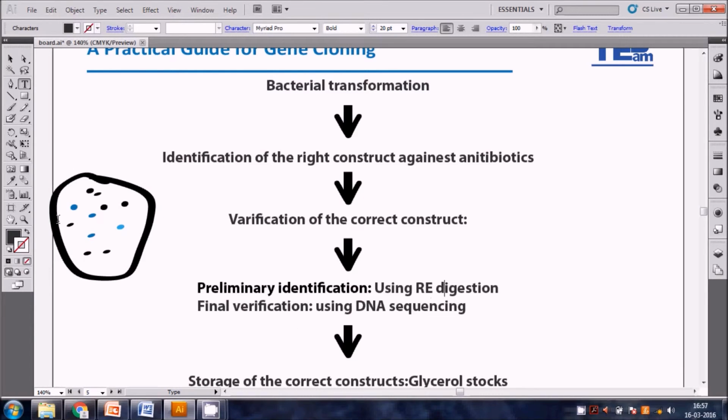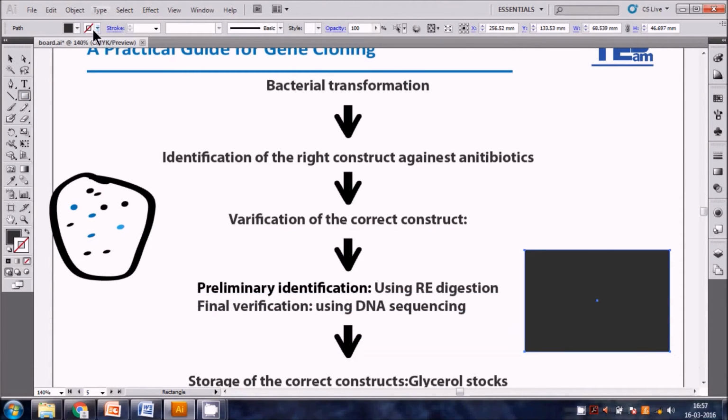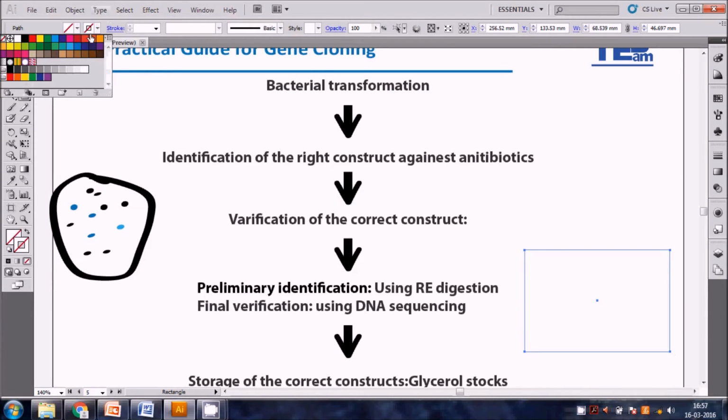So you'll take the 4 plasmids, add the NheI and XhoI enzymes, set up the restriction digestion reaction, and after that, whatever product comes, you will again run on agarose gel electrophoresis, in a 1% gel.